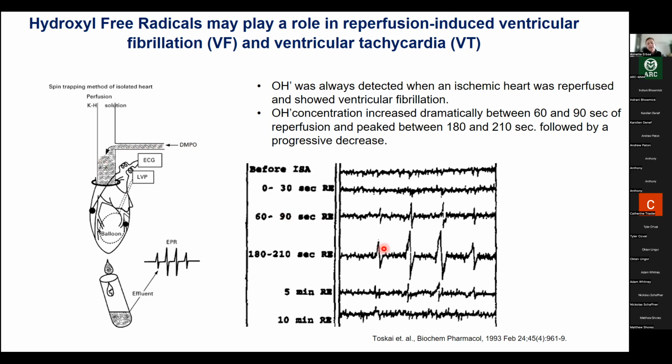And what they could see is that in the heart under these conditions, after about 3 minutes, they saw a spike of hydroxyl radicals.